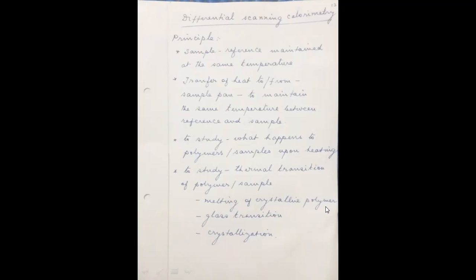You are going to maintain the temperatures of the test sample and the reference sample the same, which means that you are going to maintain the temperature difference between the sample and the reference at zero.